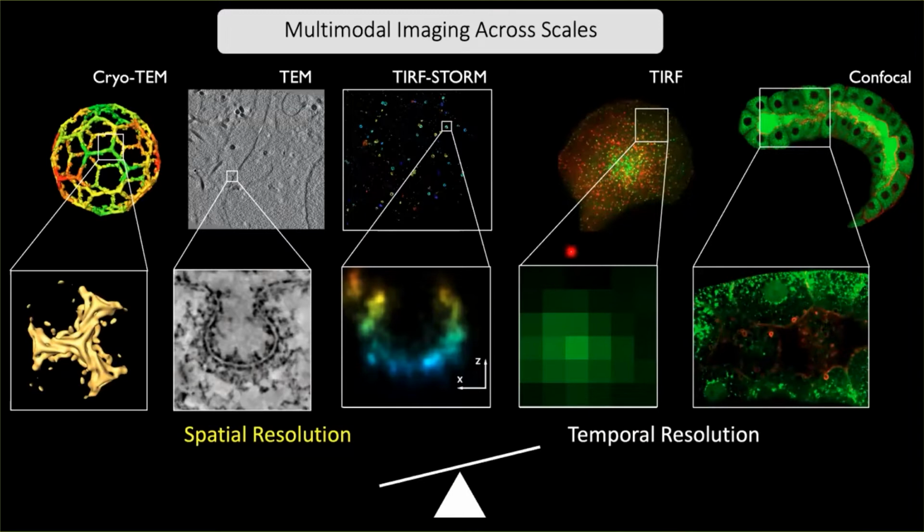And this is not the only challenge that I try to allude to with this slide. There is also, not always, but in most cases, the transition from looking at the tissue or the cell in its native condition. As we require higher and higher resolution, we normally reduce the dimensionality, and therefore we might even move completely into an in vitro paradigm to gain more spatial resolution.